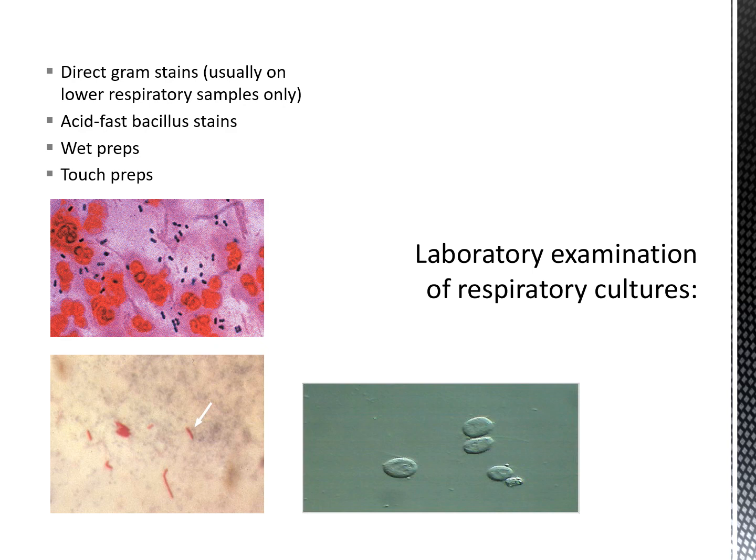And if you look at those three pictures there, we have a gram stain on the top where you can see Streptococcus pneumoniae, gram-positive cocci in lancet shapes in pairs. On the bottom left, we can see acid-fast organisms in the Kinyoun's carbol fuchsin acid-fast stain. The pink organisms are those organisms that have a very high waxy layer in their cell wall, so they don't gram stain well, but they do acid-fast stain. And then over on the right, we have an example of phase microscopy where we're looking at fungal elements.